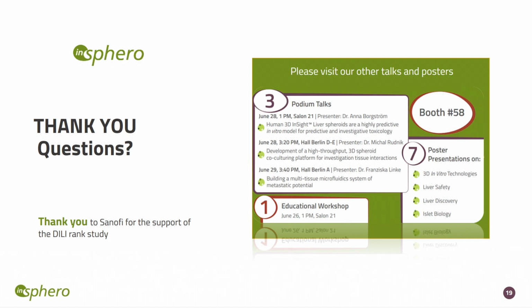Yeah, hi, thanks. Great work. So you showed that you can use this tool as a retrospective analysis evaluation tool right now to check for DILI. Any comments and ideas how you would go about doing that prospectively if you don't have the clinical Cmax value, for example? Because you had that middle range of ATP over Cmax, that was quite variable. How do you envision to pick the right category for a new compound?